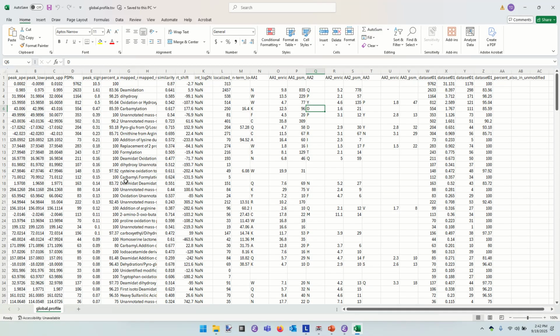So there's a much better claim here that the lysine is strongly overrepresented among things that gain the carbamylation. There's a much weaker proclivity for the aspartic acid to be associated with that same mass shift. Does that make sense? We can talk about what these log odds ratios represent, but I've forgotten the specifics of it, I'm afraid. But I believe that a 1.0 means happens about as much as you'd expect by random chance.